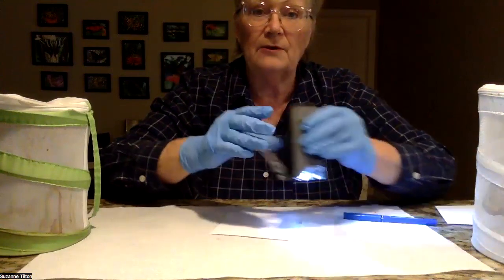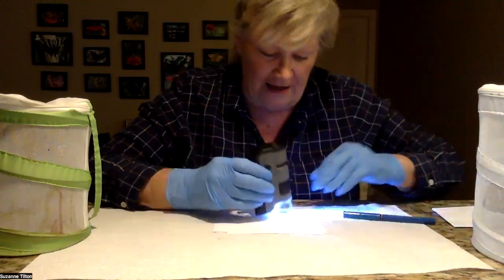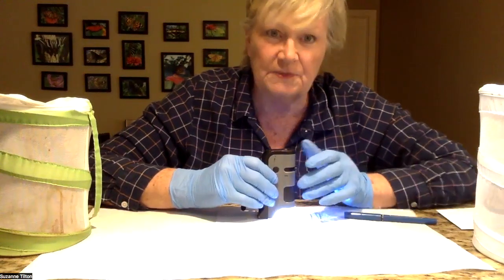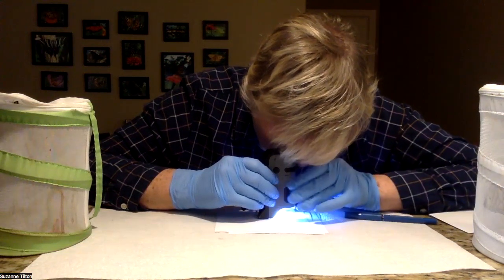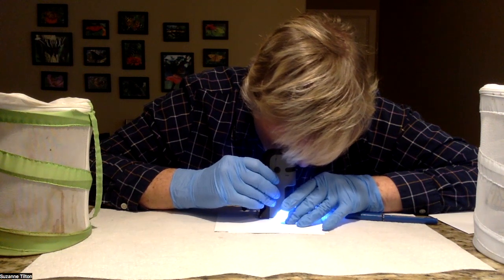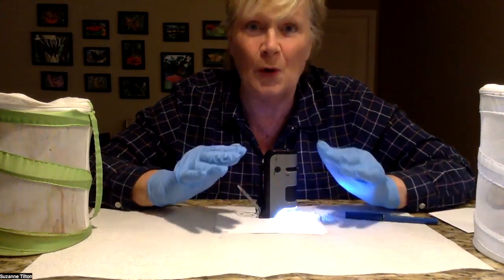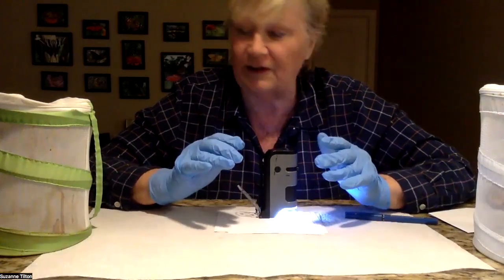Then I'm going to take my microscope. I have to take my glasses off to do this. I'm going to adjust by turning the knobs so that you can see the scales. Once you see the scales and they're clear, then if there's OE it will be very obvious. But fortunately, this is an OE-clean butterfly — there are no OE spores on here.